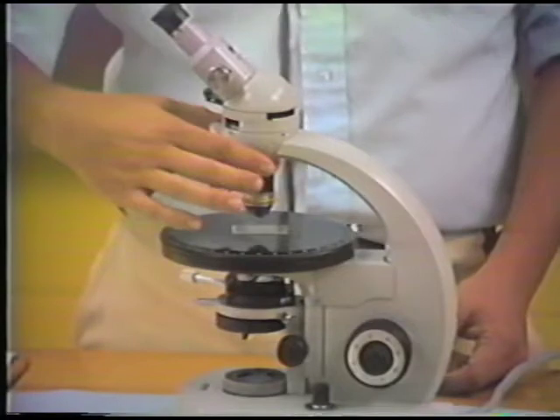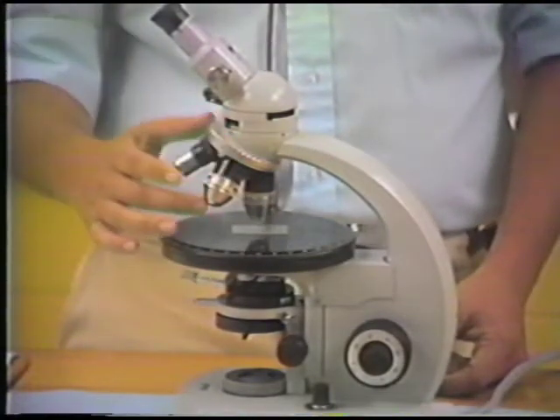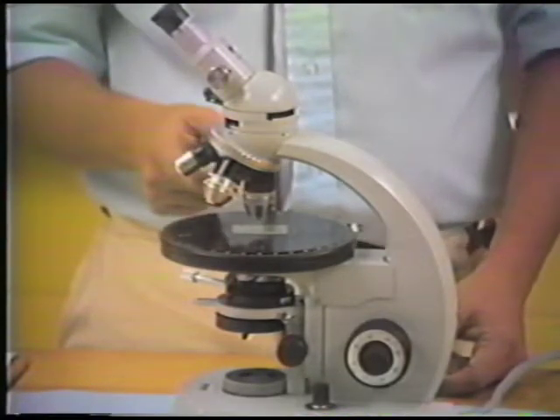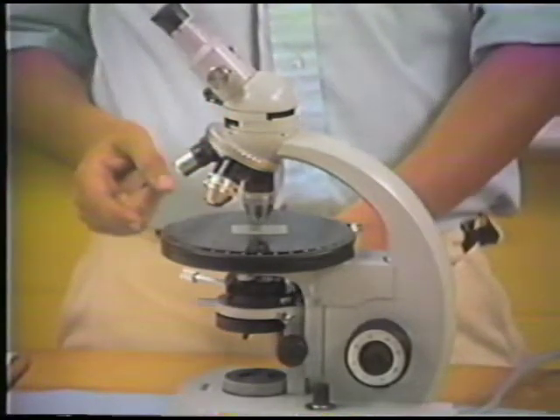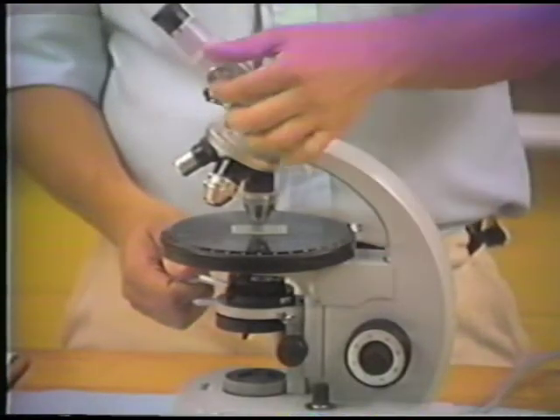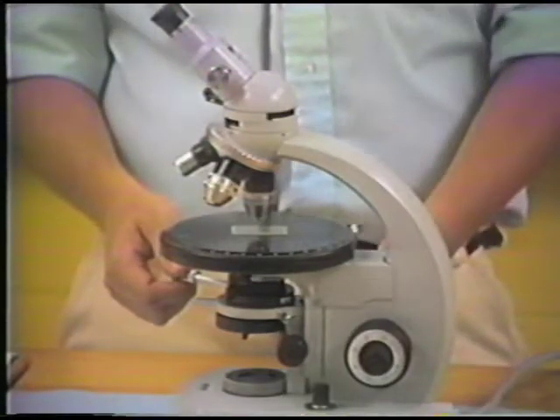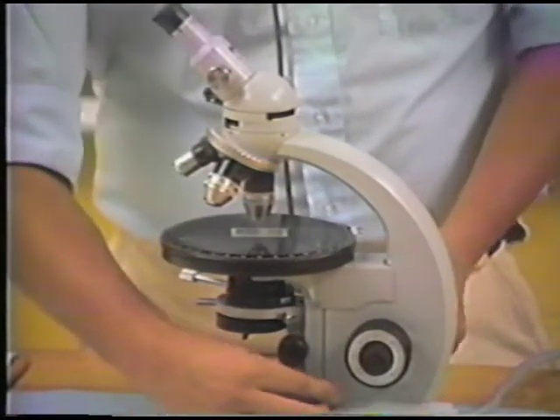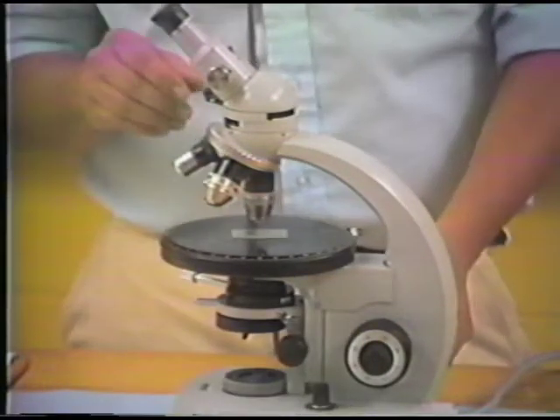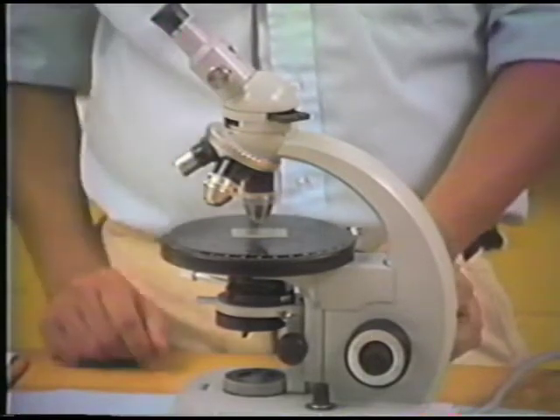And once you find this particular mineral grain, then you want to use your high power objective. You also want to look at the mineral using the converging lens and the Bertrand lens. And you need also, of course, to provide the maximum amount of light that your microscope can provide. You also always look at interference figures with the polars crossed.